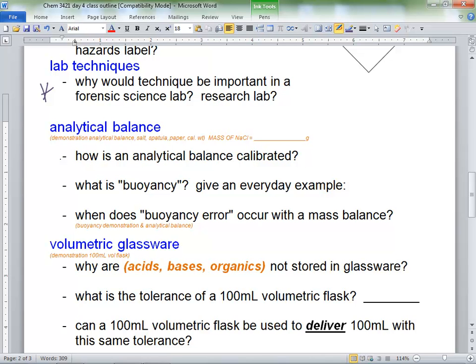the first thing I do is fold the paper. It's so much easier to get in and out of there then, right? And then I don't like to do math. Wow, he's touching the edges. Did you see that? Touching the edges of the balance. Okay. This will be a lot better.